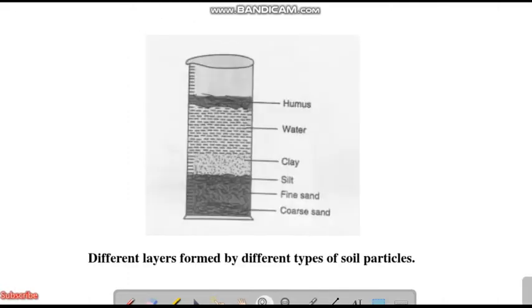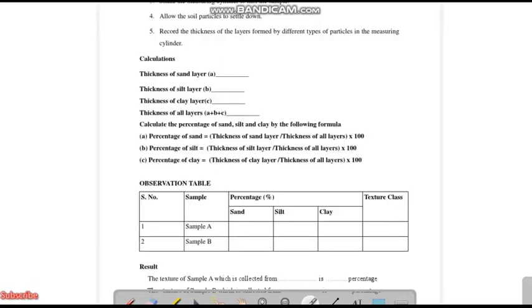After half an hour you will be getting various fractions. You will be getting coarse and fine sand together taken as one ratio, then something called silt, then clay and water and humus. What we can do is cancel off water and humus layers. We are taking the percentage of sand, silt, and clay, which we have to measure using a scale.